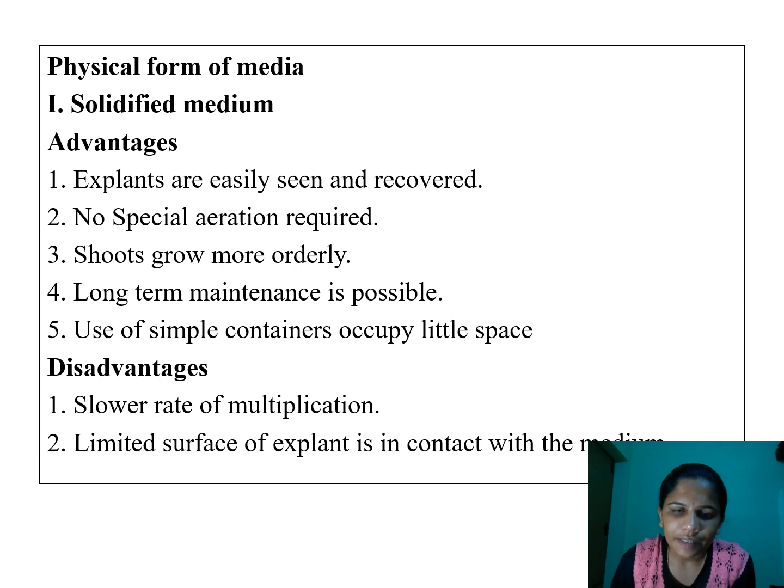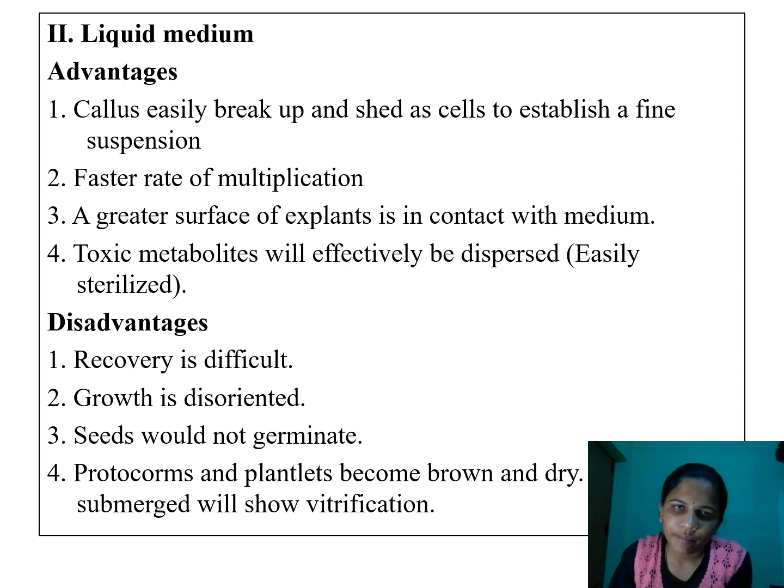And whatever explant we are using does not have much contact with the medium. The surface contact is very less, I can say. So this is one disadvantage in the case of solidified medium.